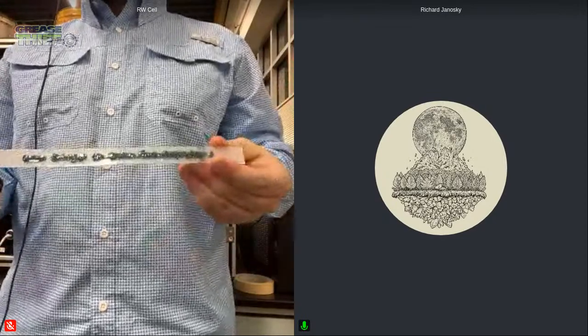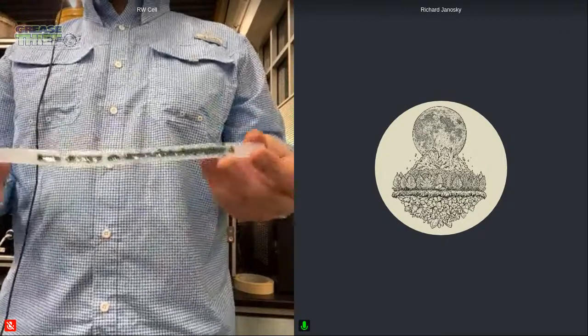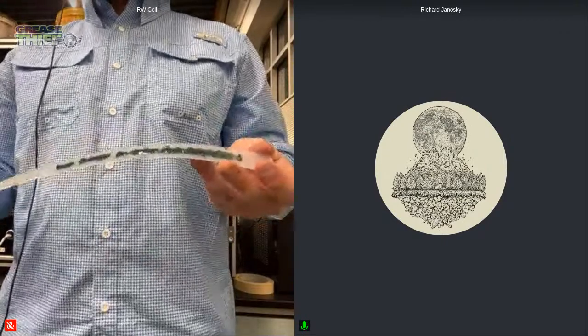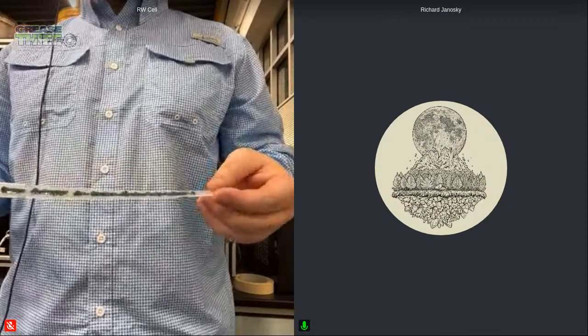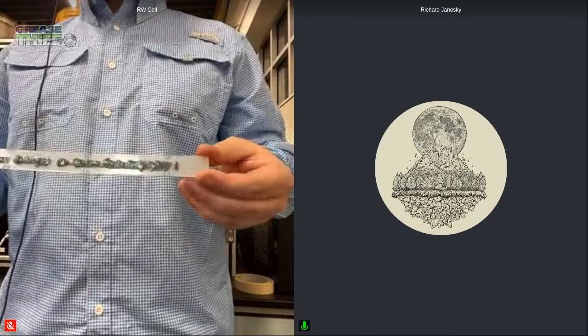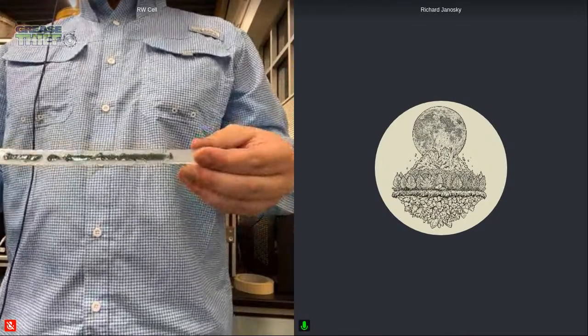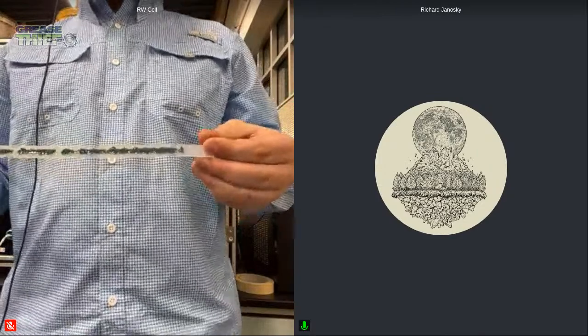So the real big advantage is that not only did we get the force value, the GTI number, the grease thief index, from our sample, but then we've also prepared it. So it's not a destructive test. It's a high value test that's also prepared the rest of our analysis.